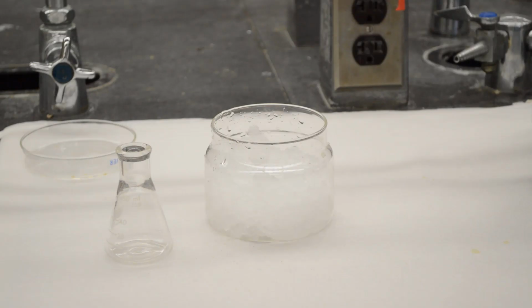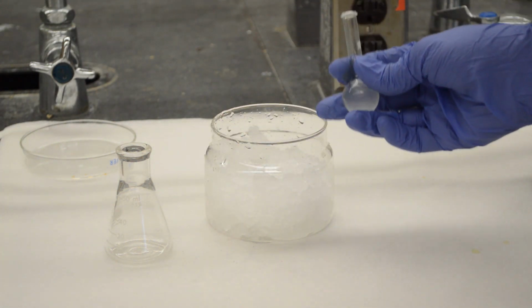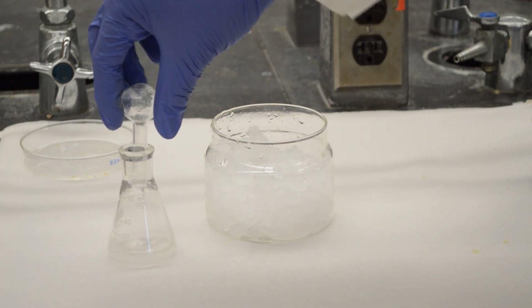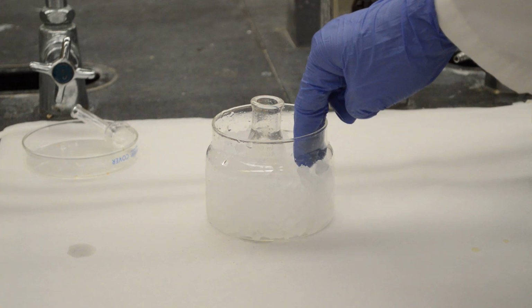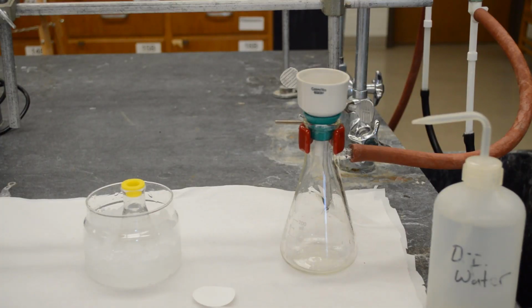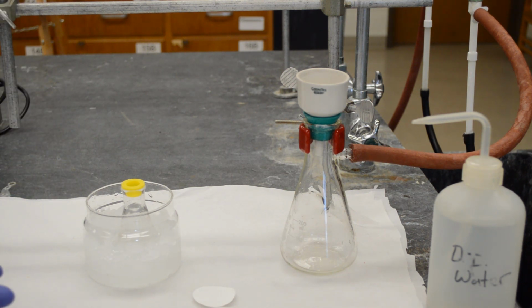Transfer the product into an Erlenmeyer flask and put it in an ice bath. After 15 minutes of cooling, let's do the vacuum filtration to obtain the crude benzoic acid.